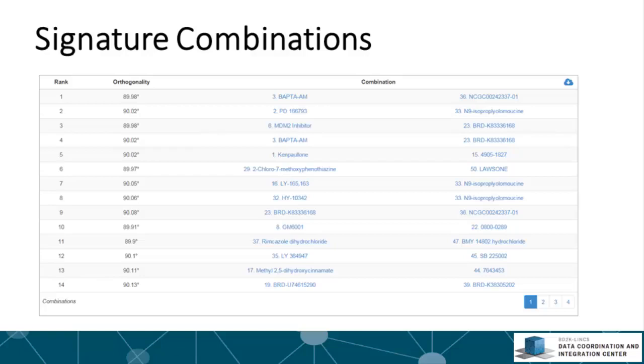When searching for combinations, L1000 CDS² compares every possible pair among the top 50 signatures for the single search. Synergy score is calculated as the combined overlap of the differentially expressed genes if the input are the two sets of up and down genes. In the cosine distance search, the synergy is calculated by the orthogonality of the two characteristic direction signatures.